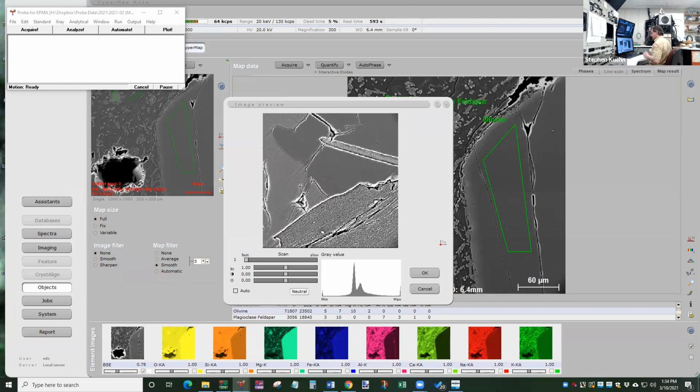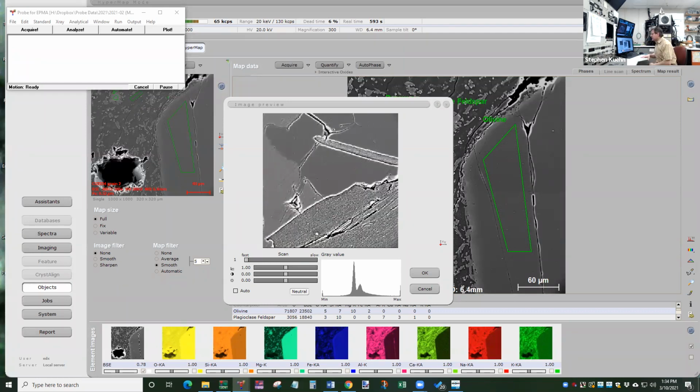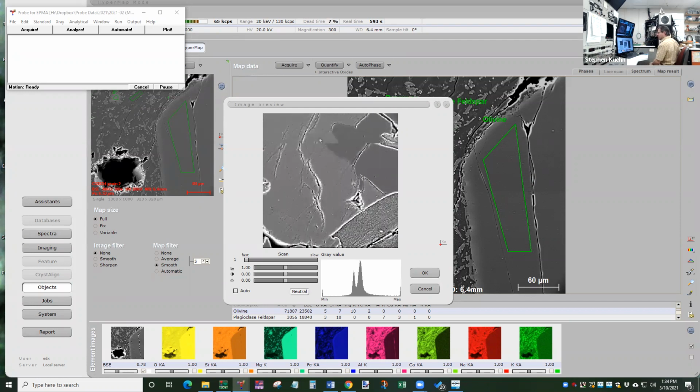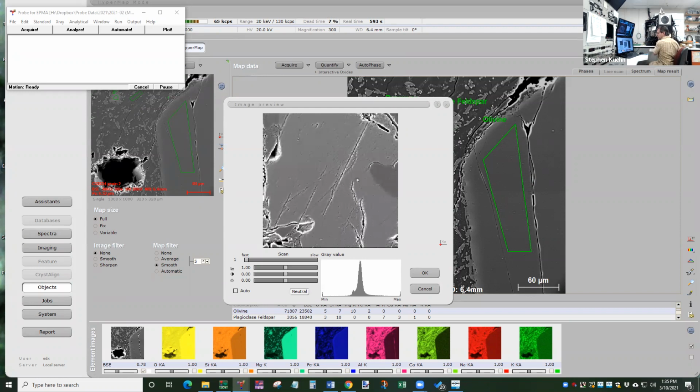Zoom out a little bit here, just so you can see a little bit larger area. So yeah, there's different things. But one of the things we can see, the texture of this rock is different. We don't have any areas with tiny little microscopic crystals. And then we've got this, which is pretty big.